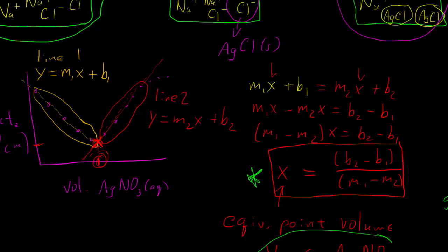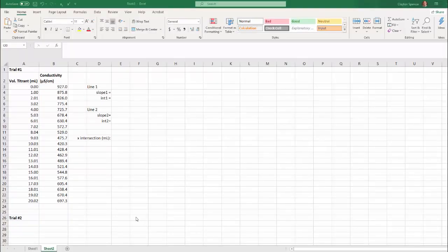So this starred equation right here, and doing all this math. I'm going to show you how we would do that for one of the trials. So let's switch over to Microsoft Excel. Here's some example data.